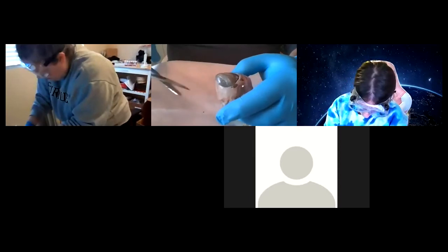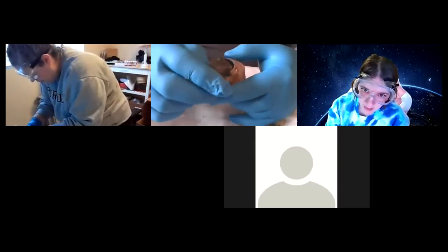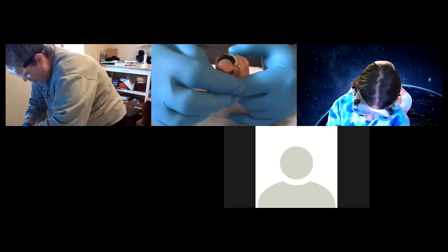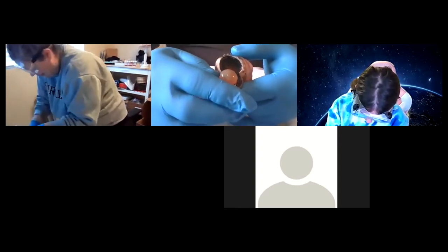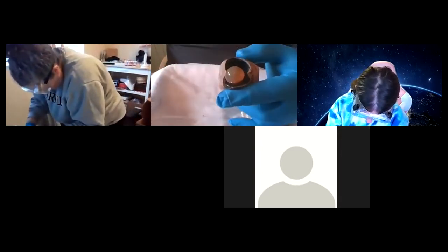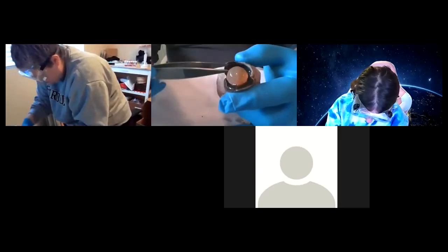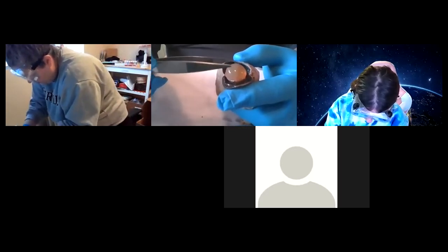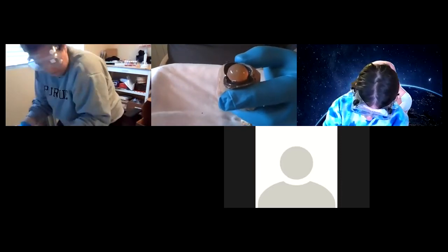Make a cut around that cornea, then you open it up. Be careful you don't squeeze this because it'll get all over your clothes. Here you can see the lens. The lens is a crystalline protein. This is organic material, but this is a dead cow, so it's hard like a marble. But it's supposed to refract light to go to the retina — light coming in from the pupil.